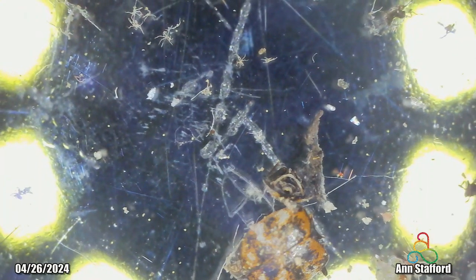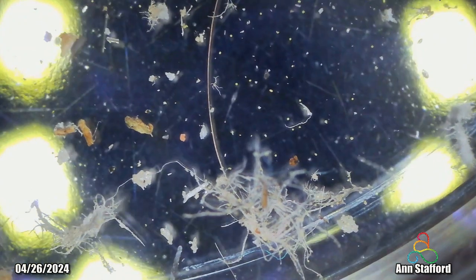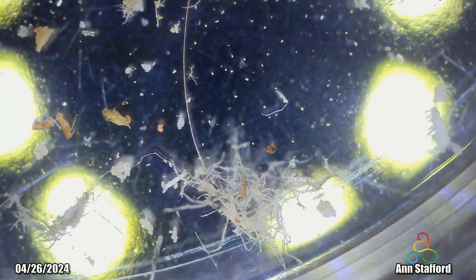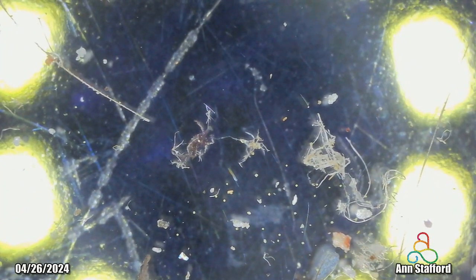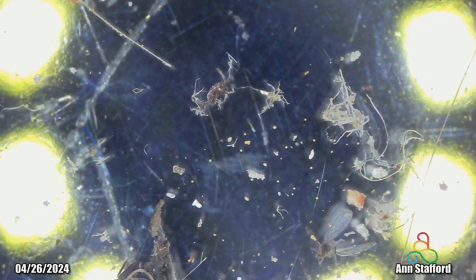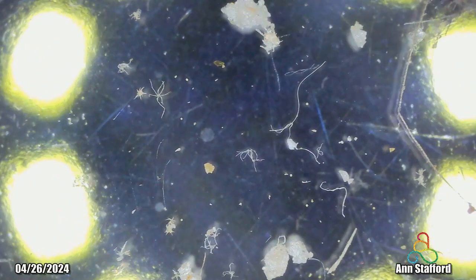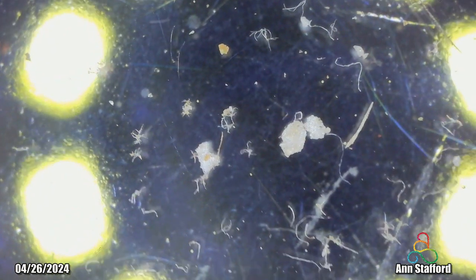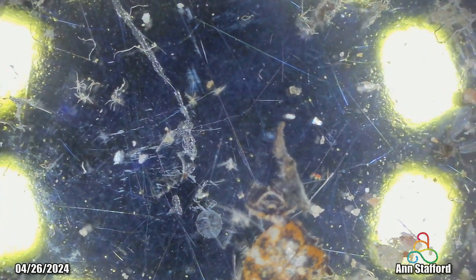Okay, now this is what is collected in the little cap. This was all on the tray, and so I've taken it off the tray. See all the hydras? There's lots of hydras. Lots of stuff. That was the ladybug body. I think that was the other dead bug body, or that one there with the wings was. That brown thing up there, I'm not sure what it is. Anyway, they're all covered in hydras. That's a fact. And hydras are everywhere. Okay. So yeah, there's a whole bunch of stuff in this little cup that I collected from the tray.